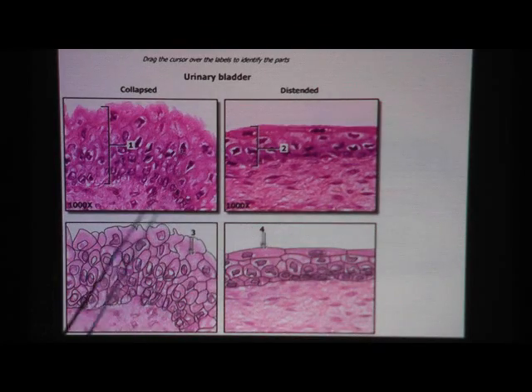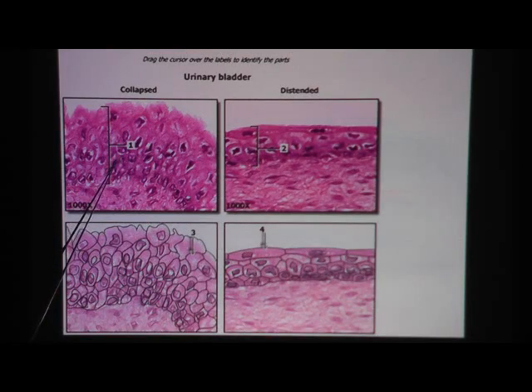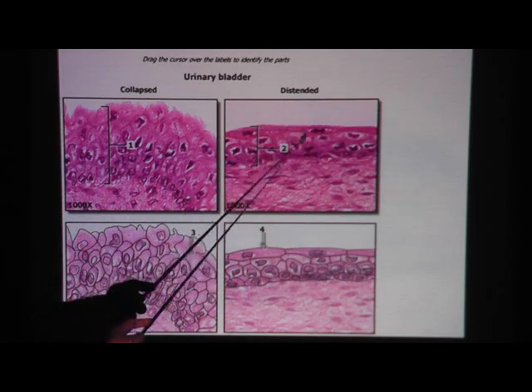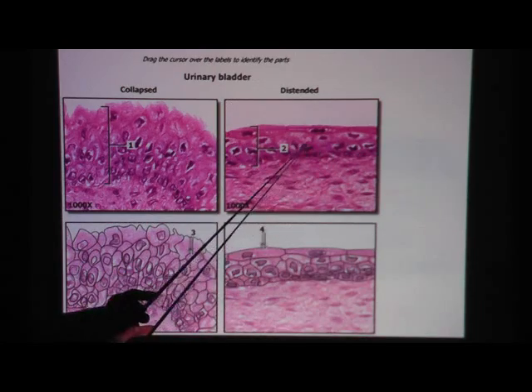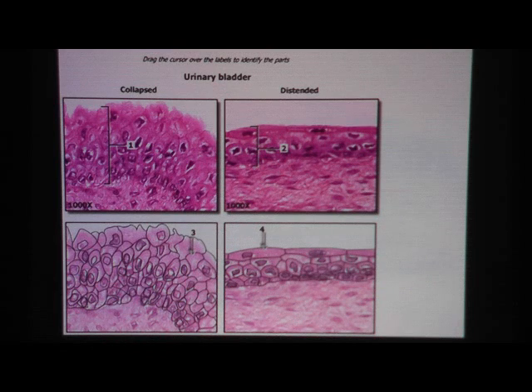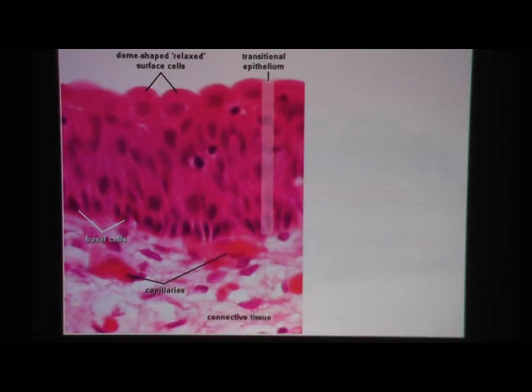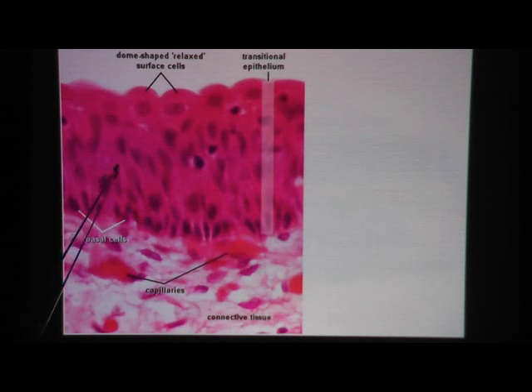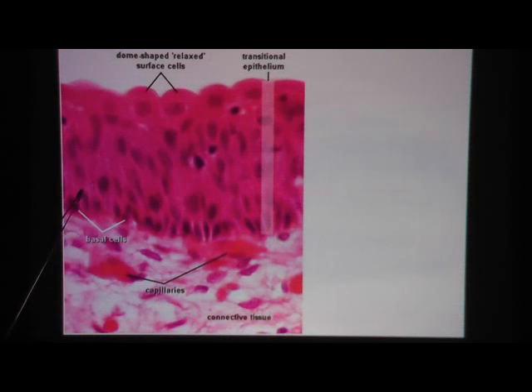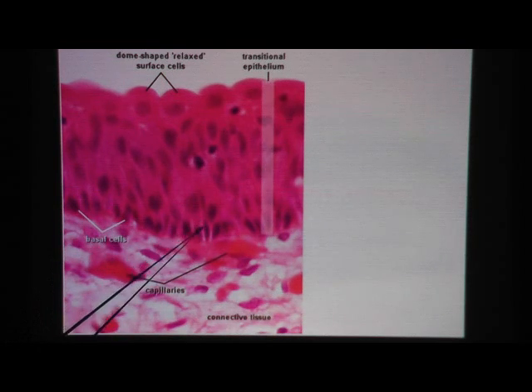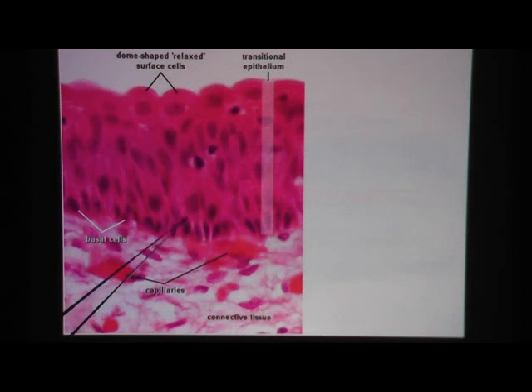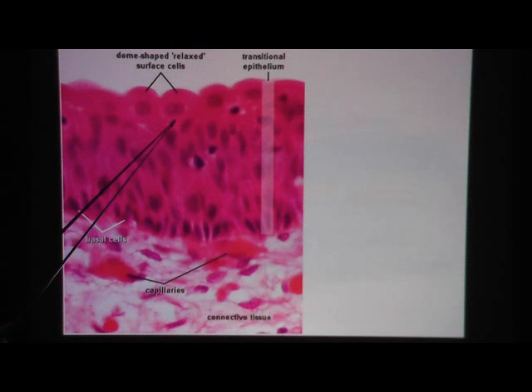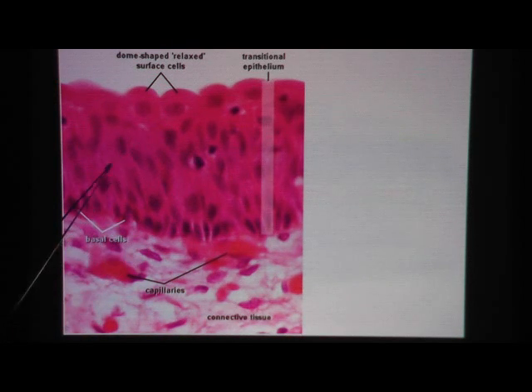Here's a comparison between the collapsed or non-distended relaxed state — so the epithelium is a lot thicker — versus if it's distended or stretched out like a full bladder, the epithelium will be stretched out and a lot thinner. In either case, you should be able to see there are multiple layers. Most of the time when we look at transitional epithelium, it tends to be in the relaxed state, like an empty bladder state. Here you see pretty thick tissue, definitely more than one layer of cells, with varying shapes — the nuclei tend to be smaller and vertical, sometimes perfectly round, sometimes the cells look like they could be columnar.